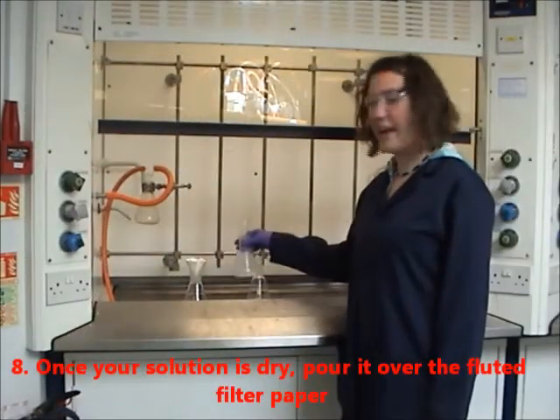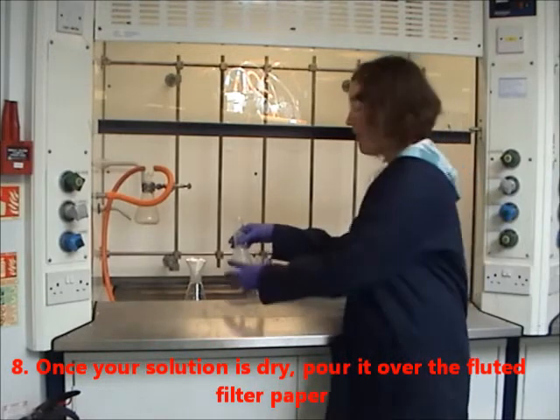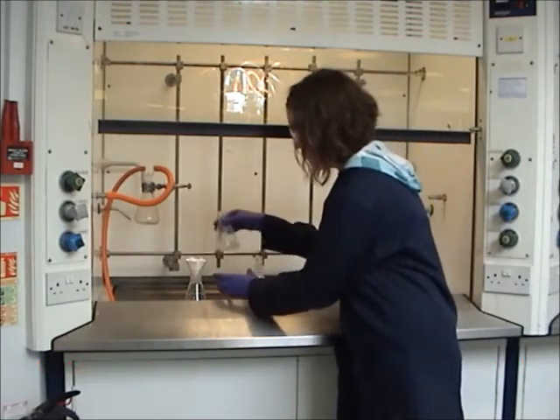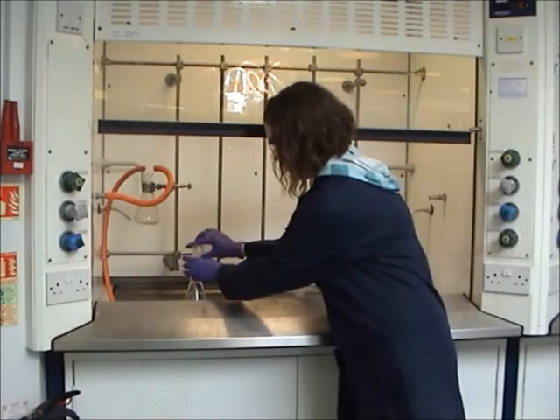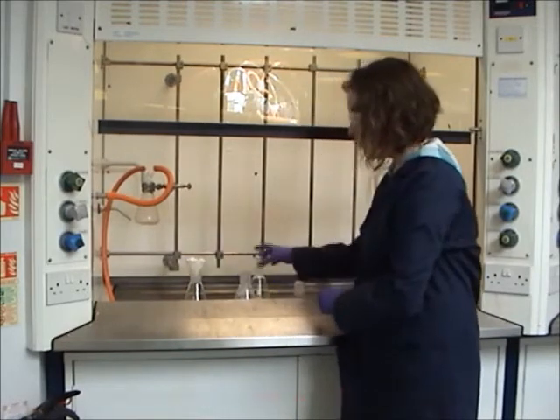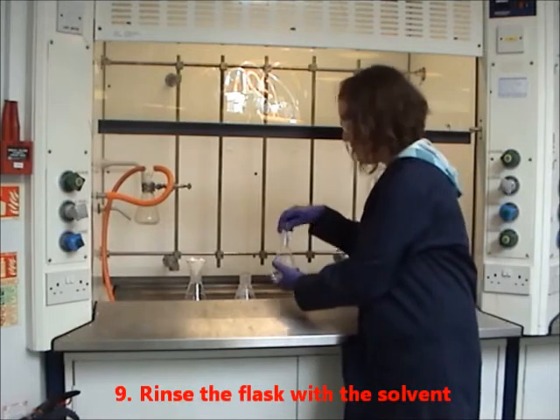Once your solution is dry, pour it over fluted filter paper. And once again, pour it through the fluted filter paper.